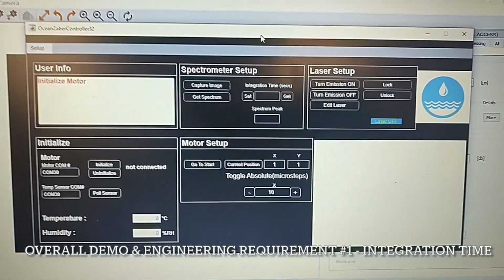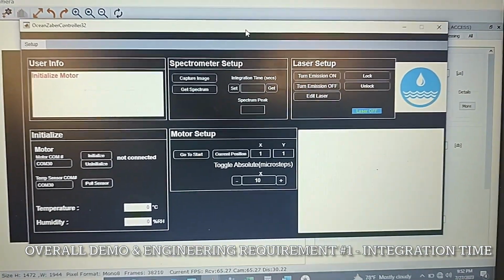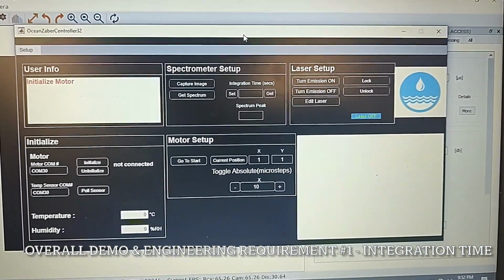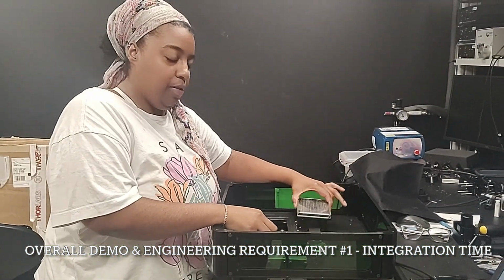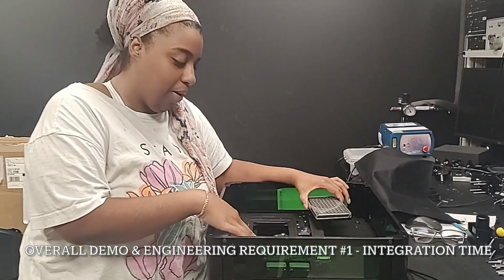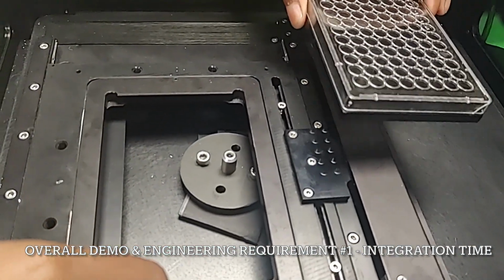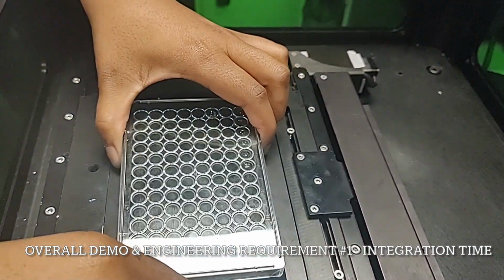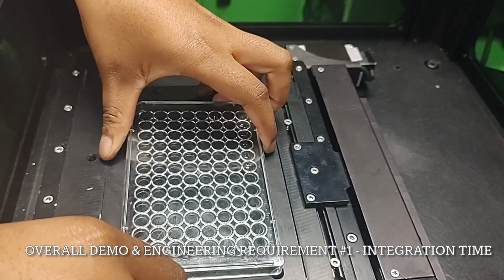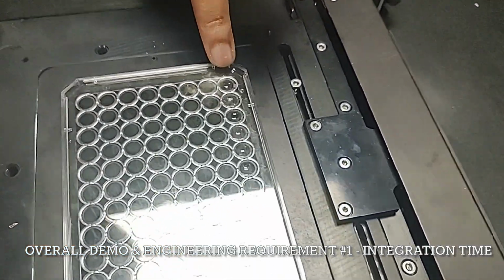So this is our GUI. This is what we'll use to control our device. We're going to go ahead and try to show you some Raman measurements. Julia? Hello, so this is our well plate reader that we'll be doing our demonstration for you guys today. So as you can see here, it's the 532 nanometer Raman probe that will be analyzing our chemicals today. Currently, it is sitting under the wrong chemicals, so George will move it to cell A1, which is right here, which is potassium chlorate.